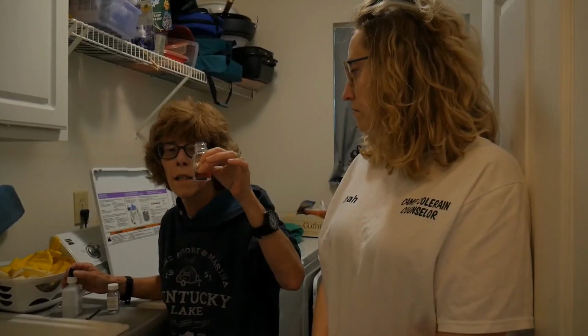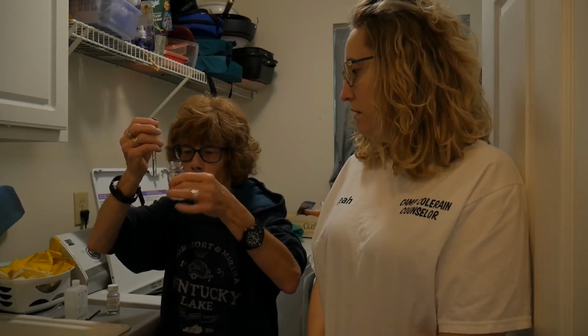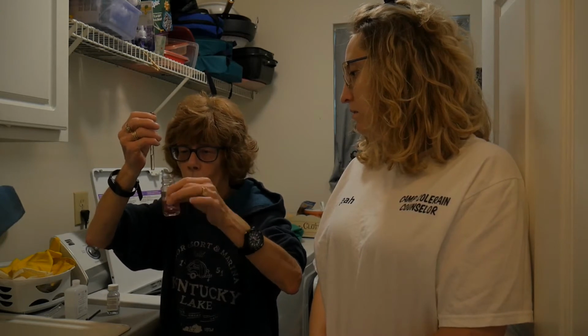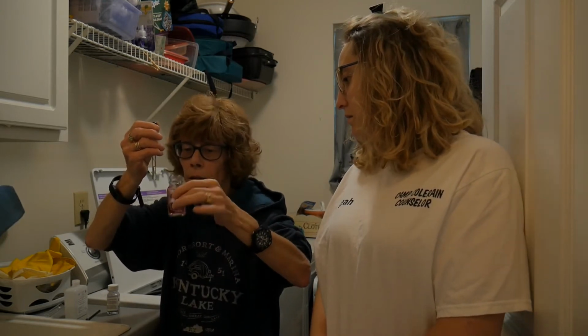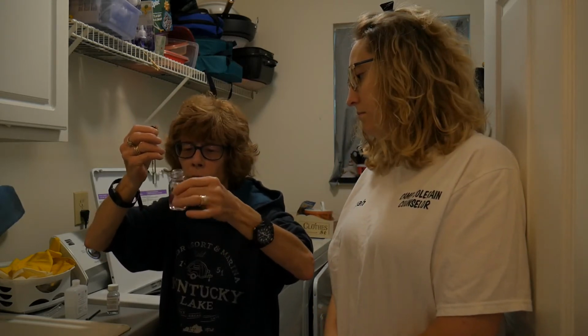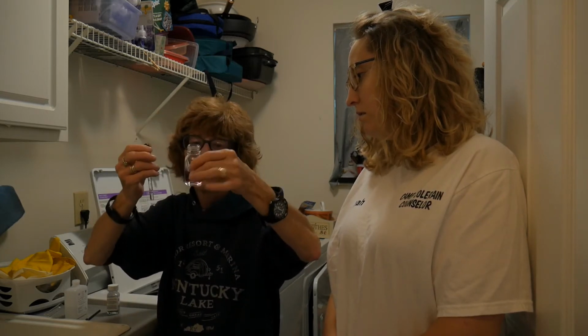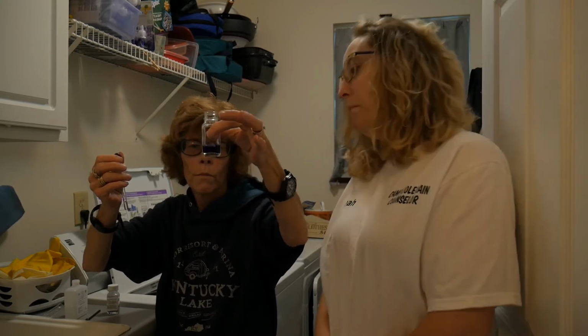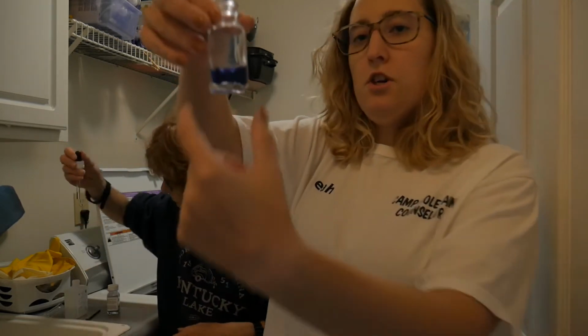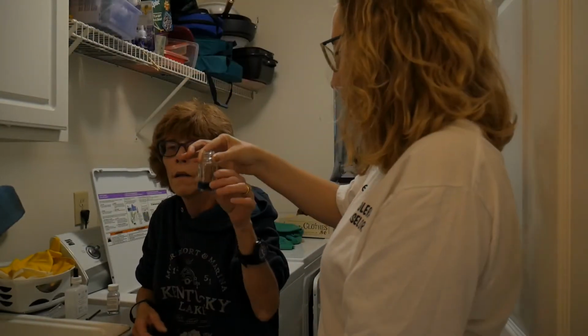Okay, so now, since I don't know what the water is, we're going to put drops in one at a time to get this to turn blue. 1, 2, 3, 4, 5, 6, 7. And we've got blue. You want to put that up there so it took 7 drops to turn this blue. And that's normally what we run, is 7.